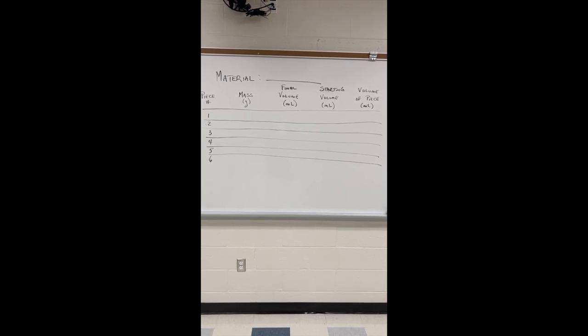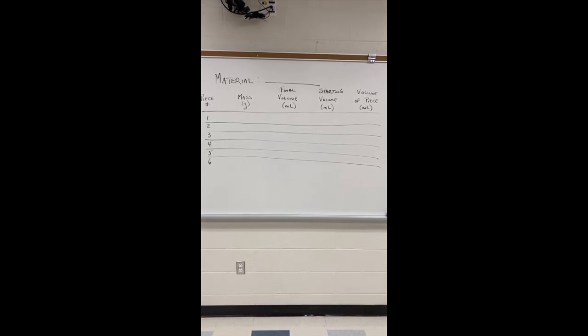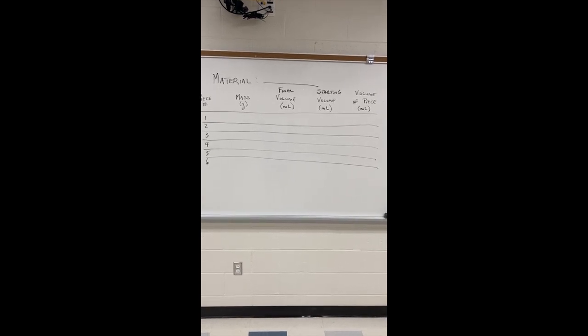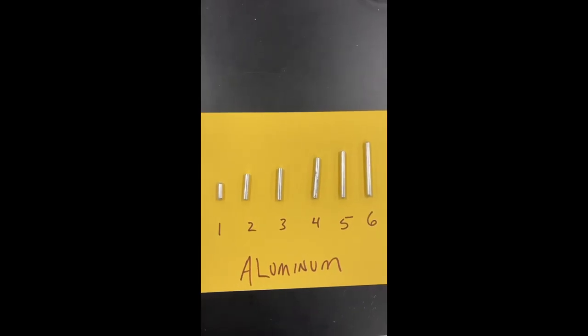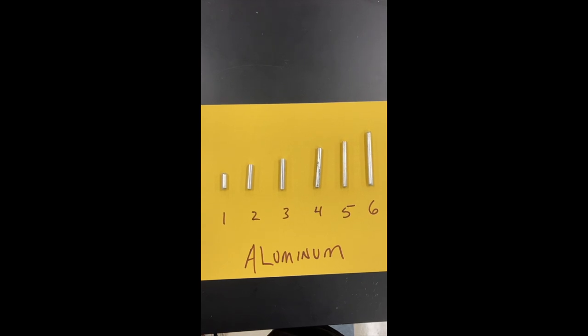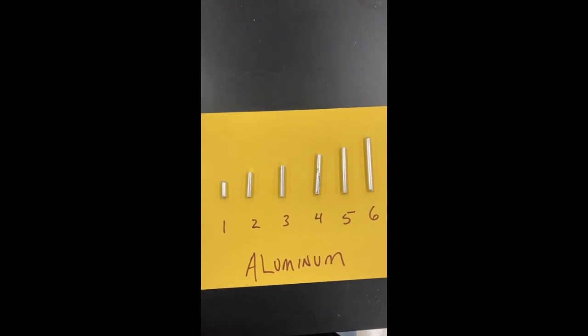Then we're going to subtract them to find the volume of each piece. In this lab we're going to find the density of some aluminum pieces. I've got six chunks of aluminum here, one being the smallest piece, and they each get gradually larger.